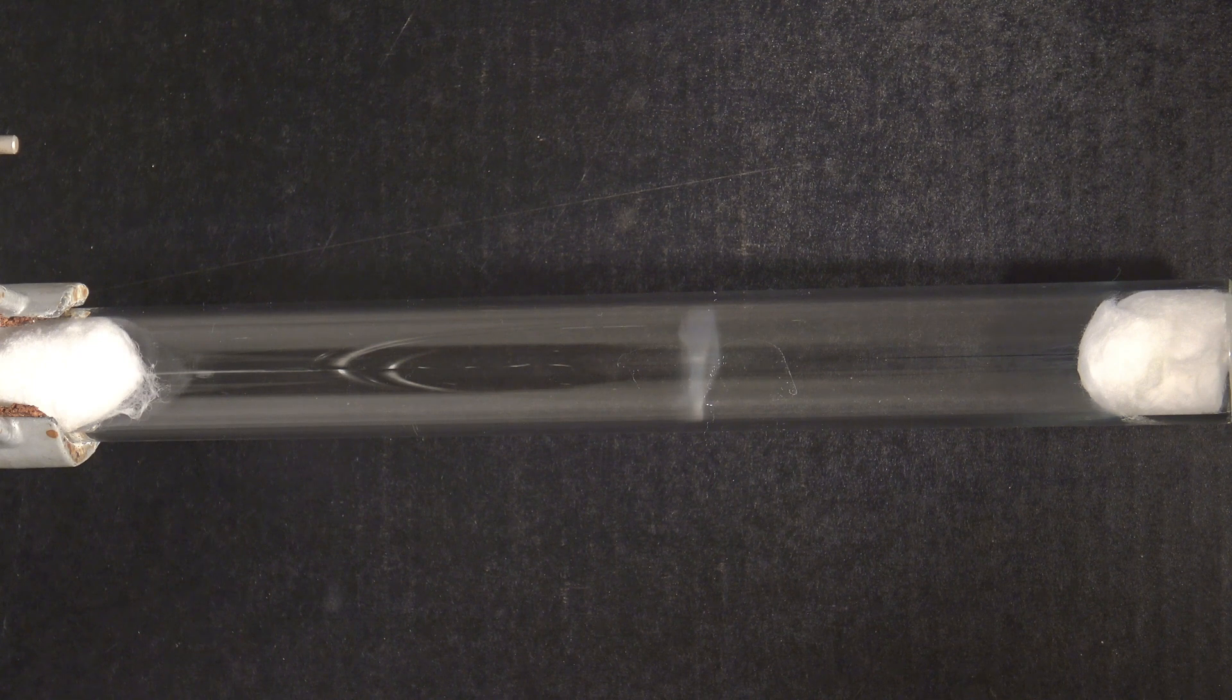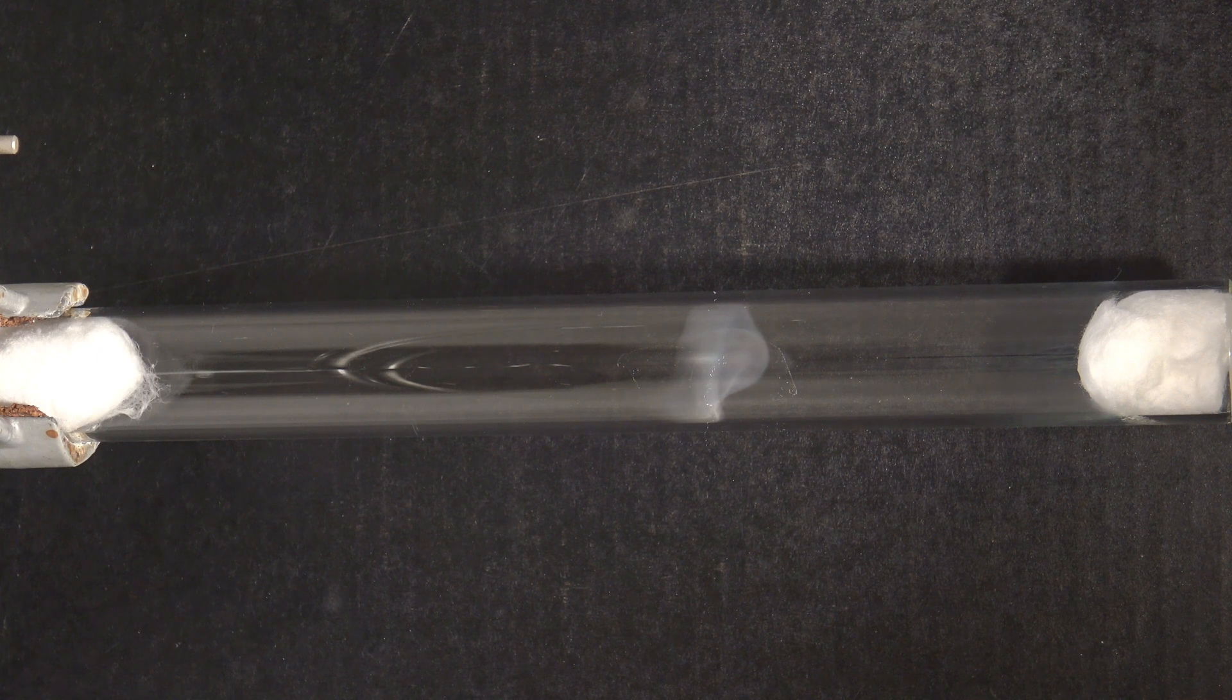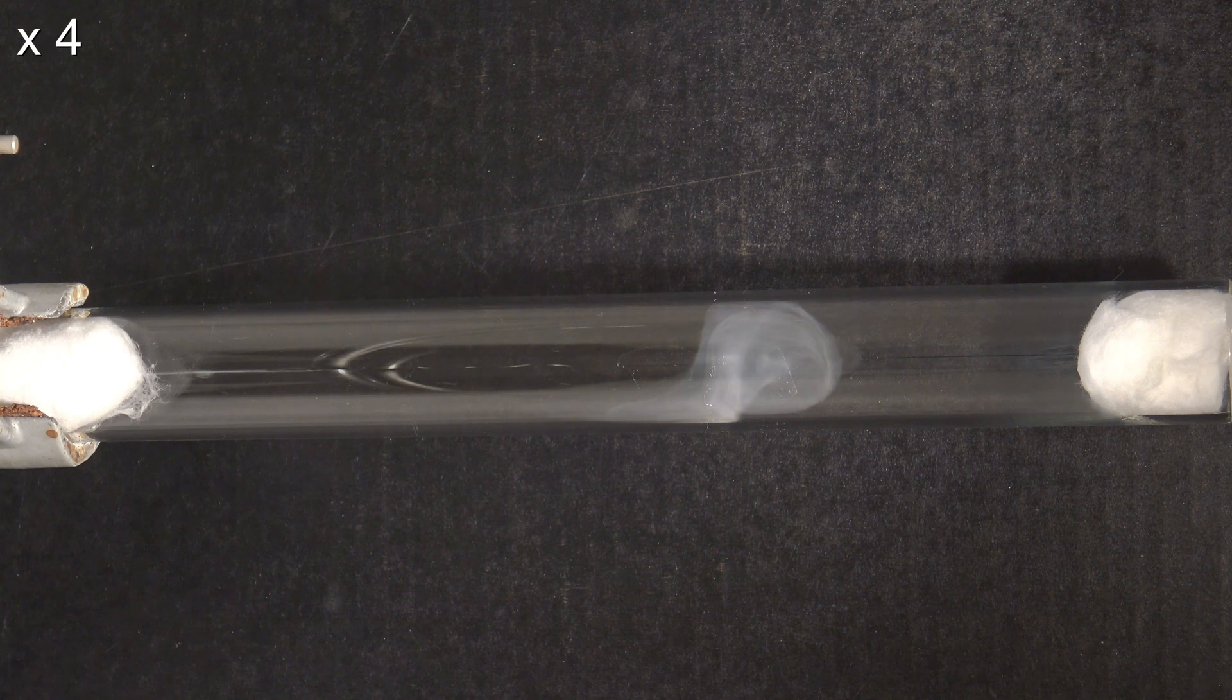Hydrogen chloride is heavier than ammonia and the reaction produces heat, which causes the movement of the smoke. The tube was also slightly tilted, so the cloud moved to the right, which was a bit higher than the left.